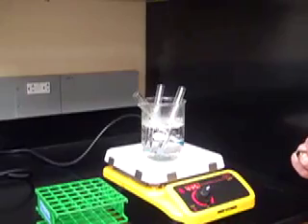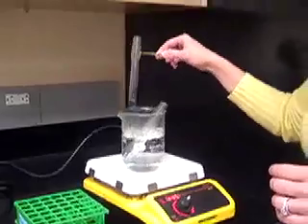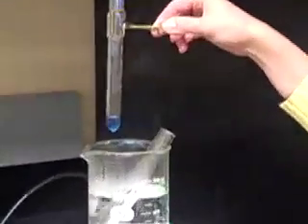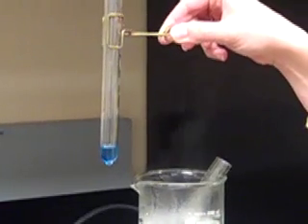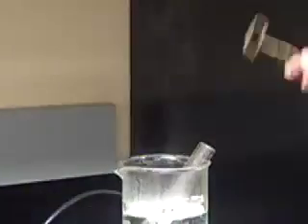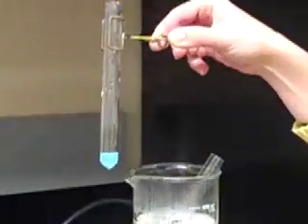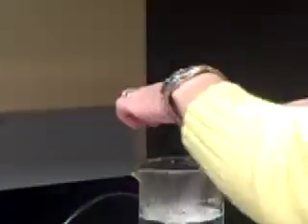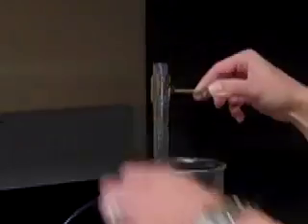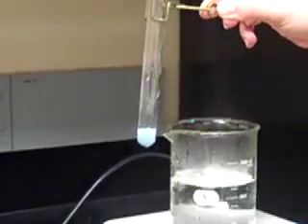So now we're going to get our results from our Benedict's test. This is the solutions that have been mixed at room temperature. This is test tube one — it had the water and saliva. Here is test tube two — this was starch and water. And then test tube three, which was saliva and starch, looks like this. So you should record all of those results on your table.